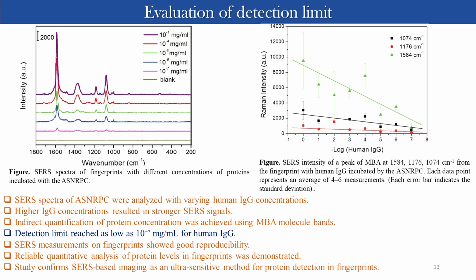Usually we plot a graph, and then you will say what the detection limit is. And in this case, they have used 3 wavelengths to detect. And this bar, you might be knowing, what is this bar called?